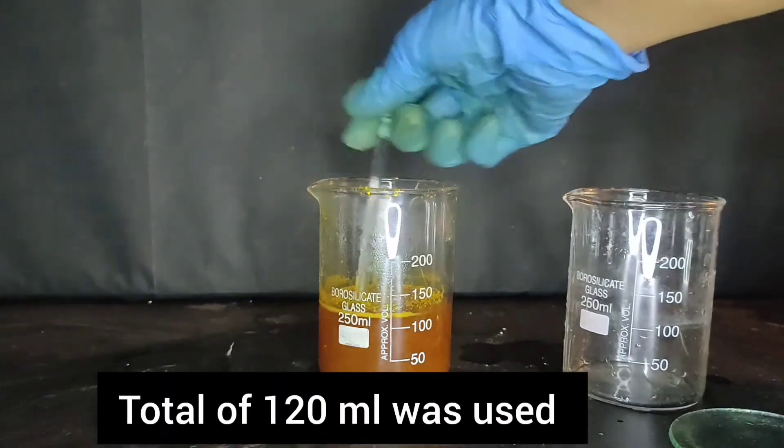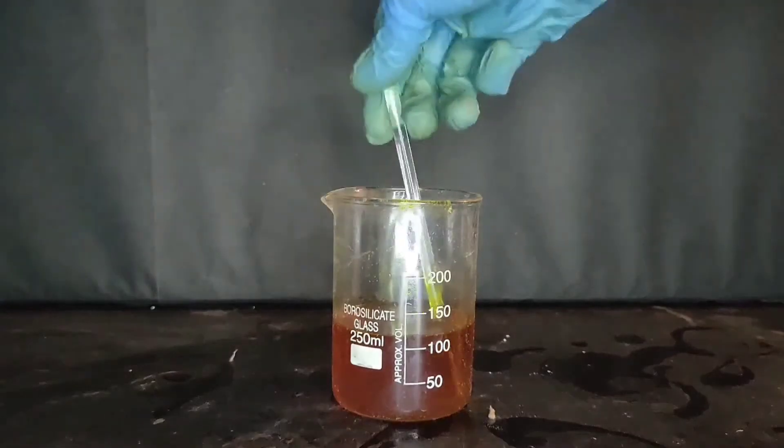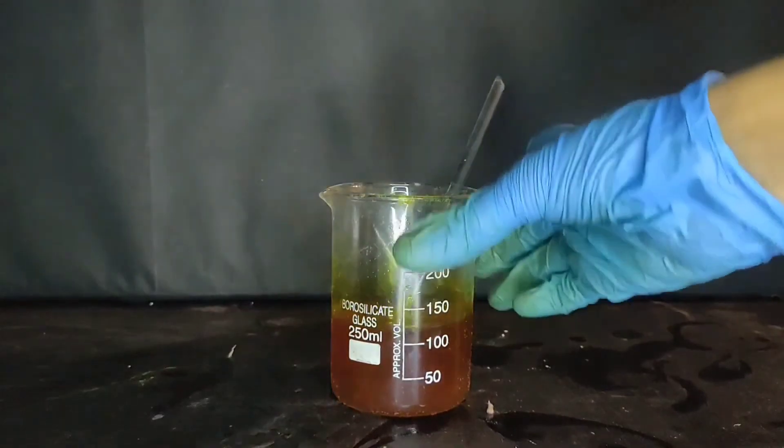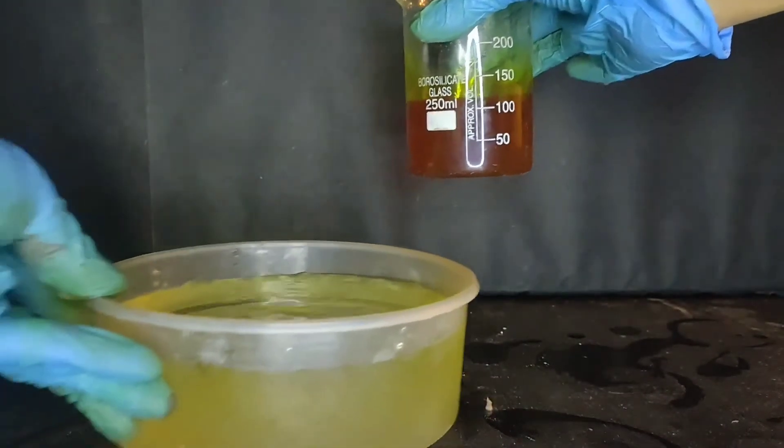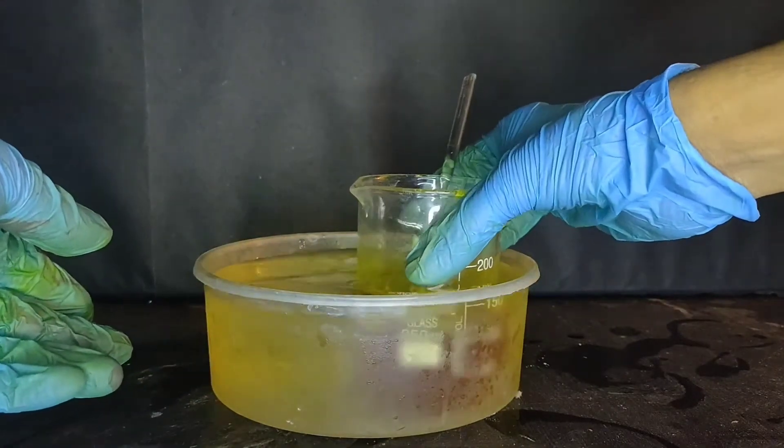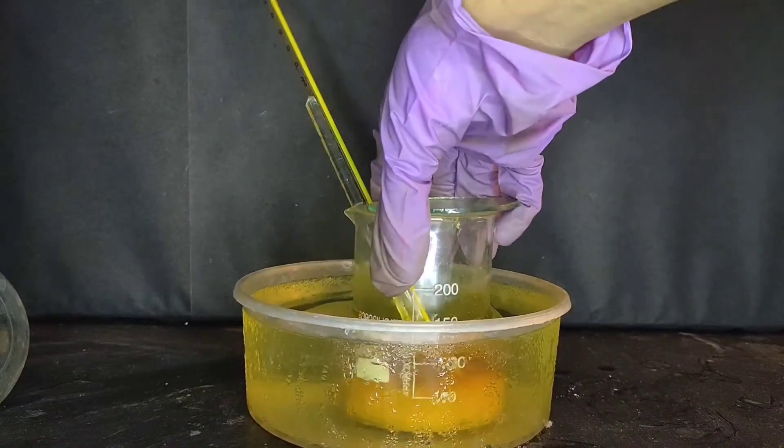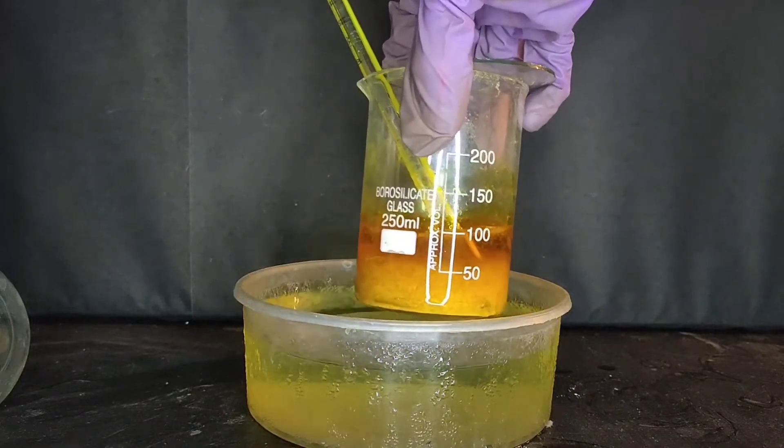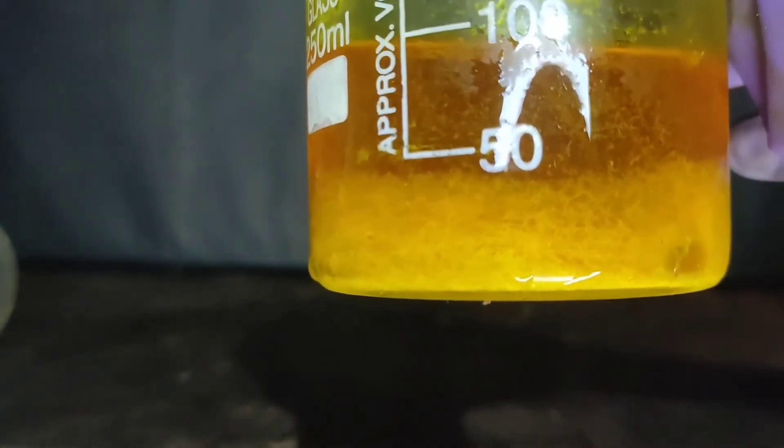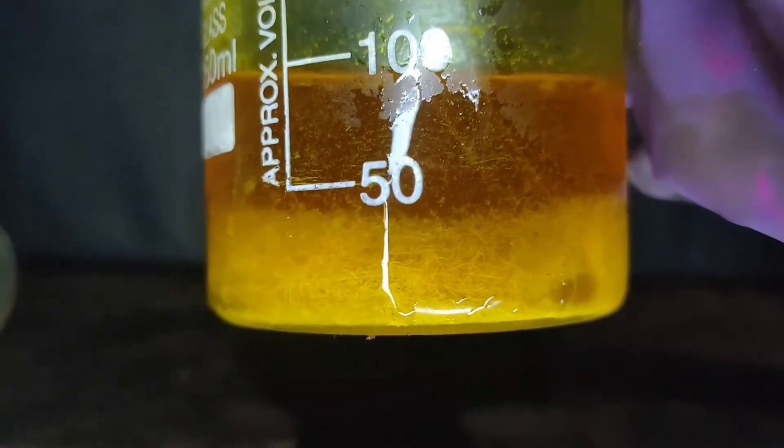In total, 120 ml of solution was used. Now, when everything has been dissolved, this beaker is put into an ice bath to chill. On recrystallization, yellow needle-shaped crystals of para-nitro aniline were formed, which were filtered off using Buchner funnel.